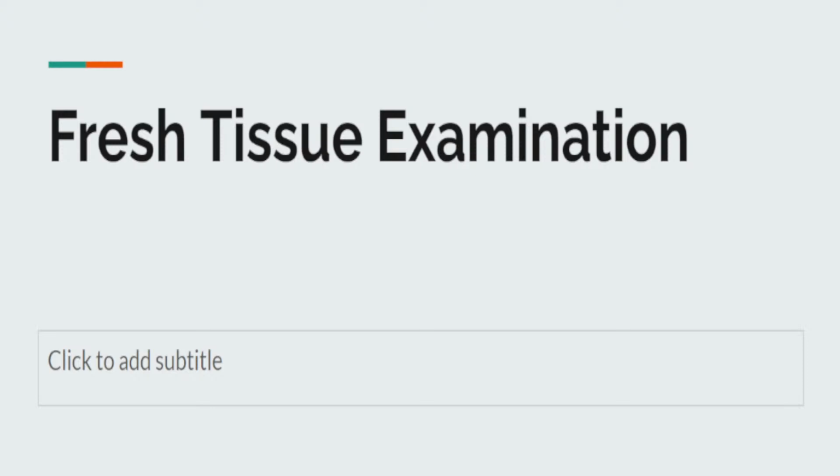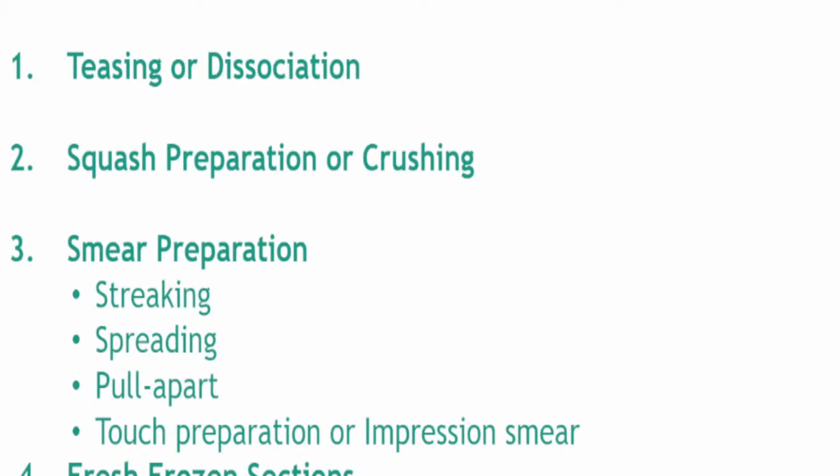We always come through the process first, right? We do gross examinations, and we sometimes call fresh tissue examination the macroscopic studies. That's what we do first, and we have four methodologies in which we do that.